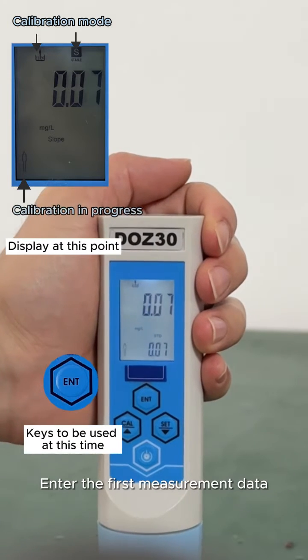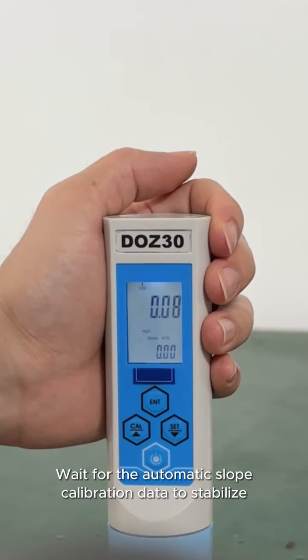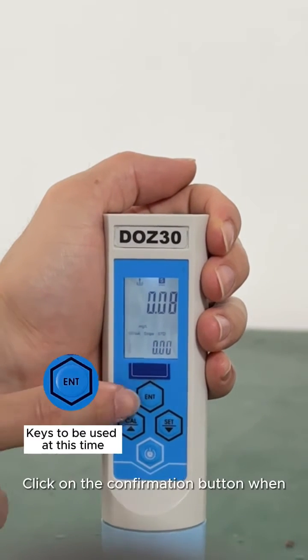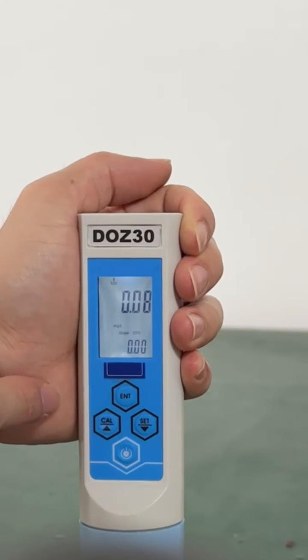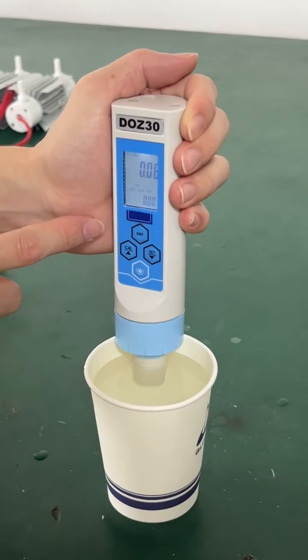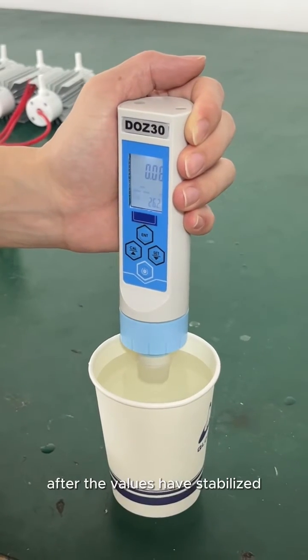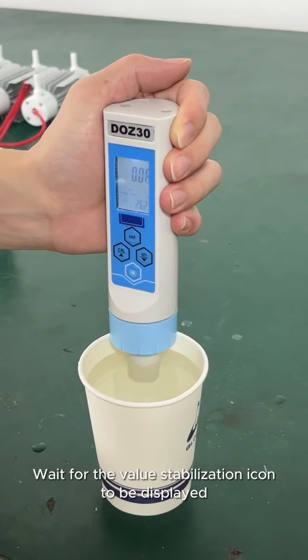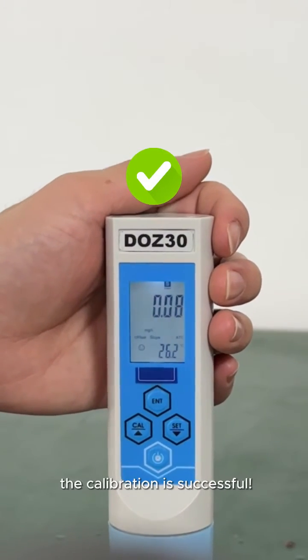Wait for the data in the water to stabilize, then press the confirmation button to enter the first measurement data. Click the confirmation button again and wait for the automatic slope calibration data to stabilize. Click the confirmation button when the data has stabilized, then press the power button to return to the initial screen. Wait for the value stabilization icon to be displayed — the calibration is successful.